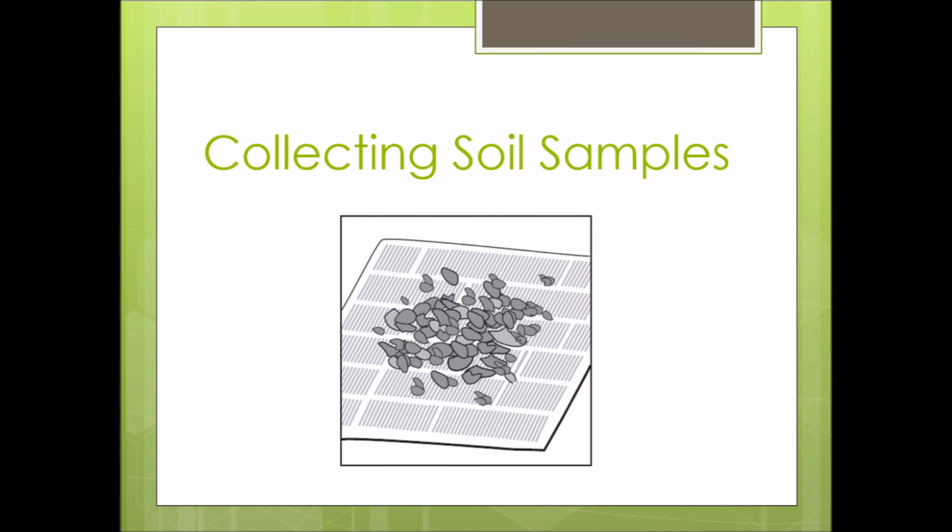Based on our observations, soil retains water at greater depths. Dig out a large soil sample from each soil horizon. Avoid the areas of soil that were tested with vinegar and avoid touching the soil samples so that the pH measurements will not be contaminated by acids on your hands.